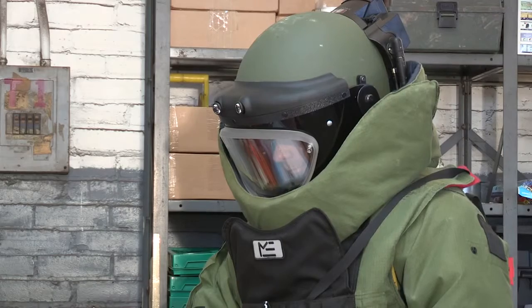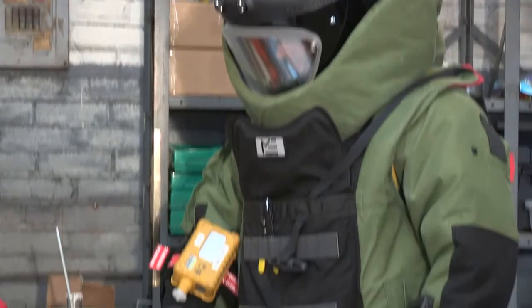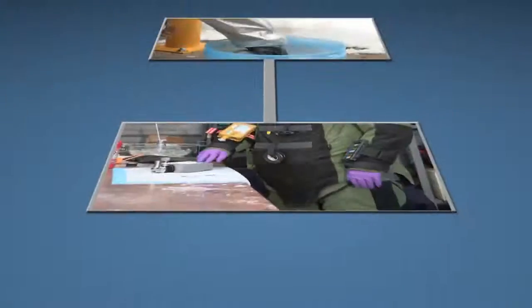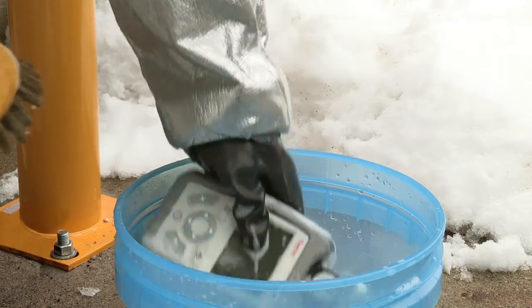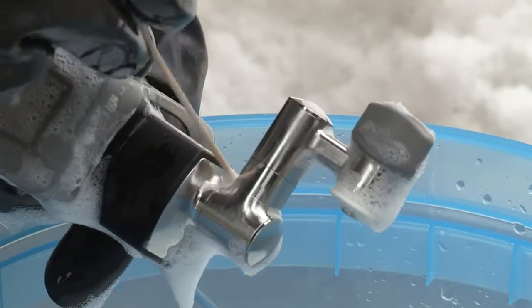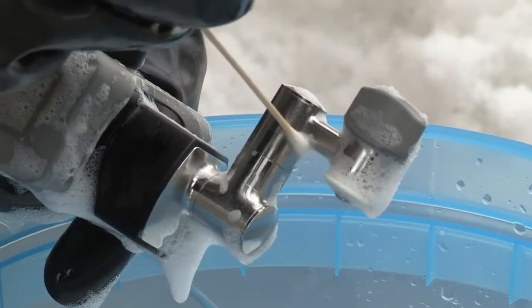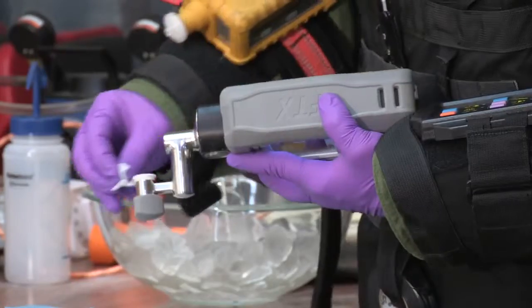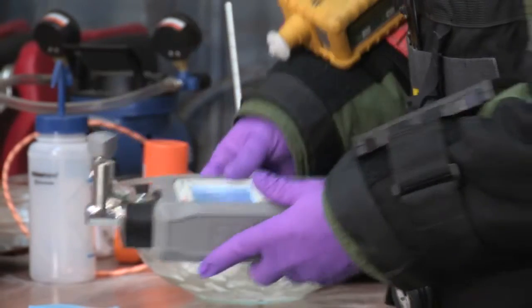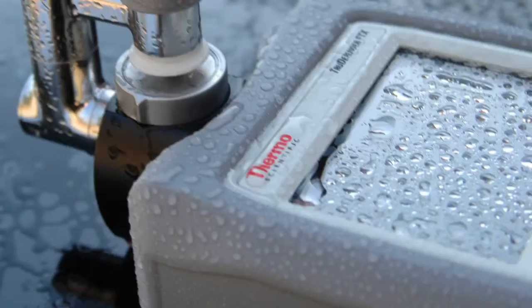The True Defender FTX instrument can be submerged in decon solution, and no disassembly is required to clean the highly polished, rounded corners. The anvil head pivots to allow the user to clean the anvil tip and sample area. We understand how and where our instruments are used—given our customers' missions, durability isn't an option, it's a necessity.